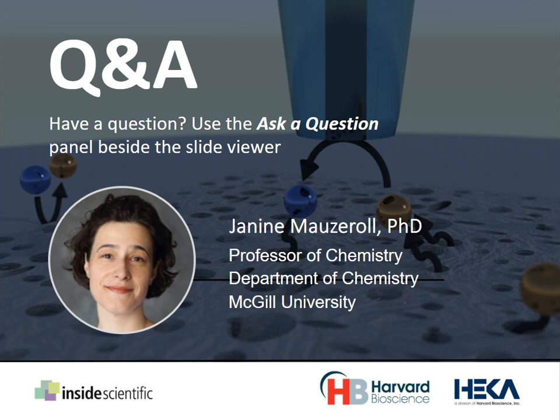Excellent. Next question here. Nagash has said, hello, Professor Mauzeroll. That was a very interesting talk. I'm new to the field and would like to know if SECM can be used or has the potential for wet etching nanofabrication in situ using scanning imaging techniques. Do you or your colleagues or collaborators have any similar experience in this field? Thank you for attending and thank you for asking a question.